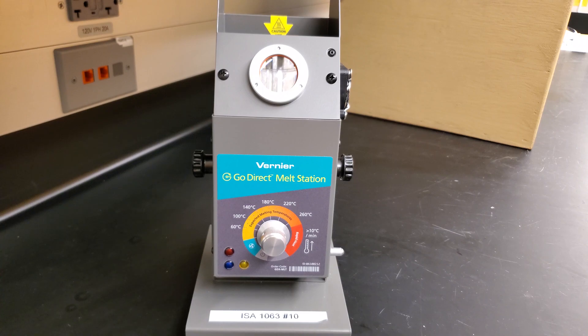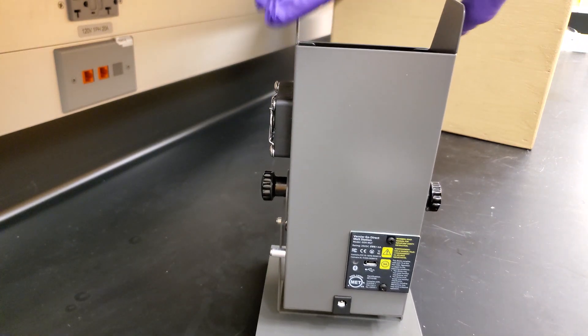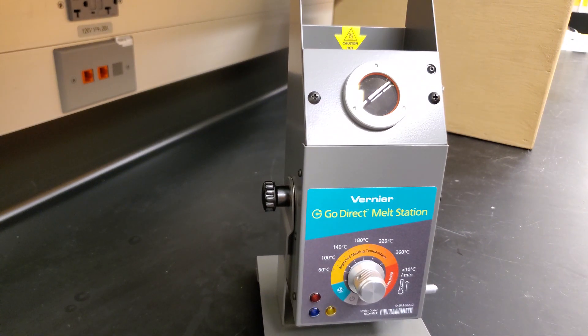The one that we use here at USF connects via Bluetooth or via USB to your device — this is for the USB. In order to get the app, go to the App or Play Store and download Graphical Analysis 4. You'll then choose Sensor Data Collection and connect via Proximity Connect.